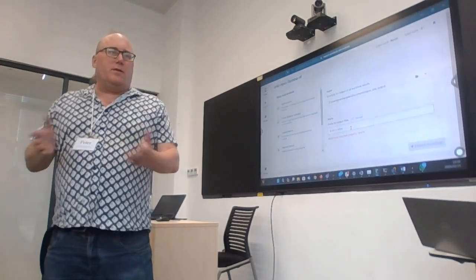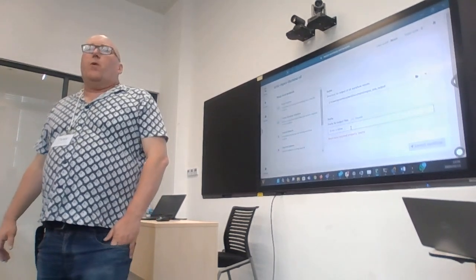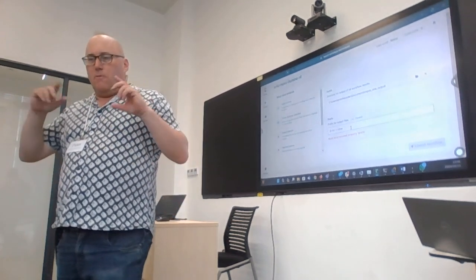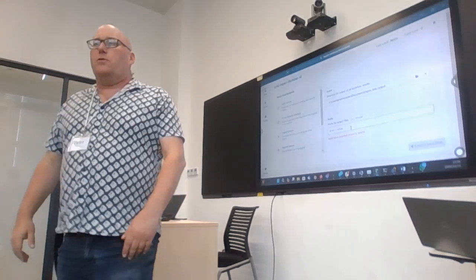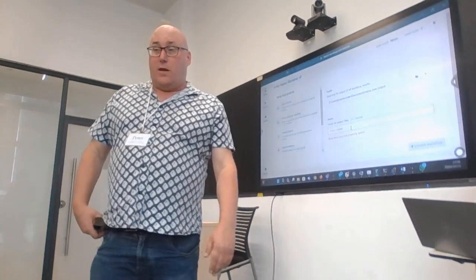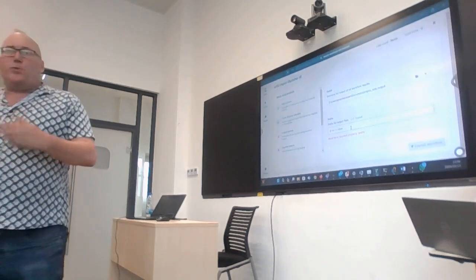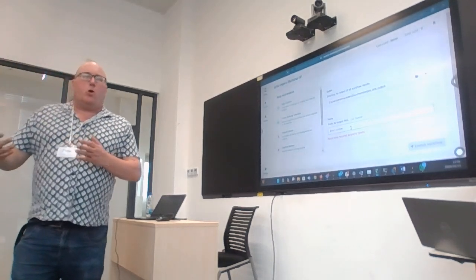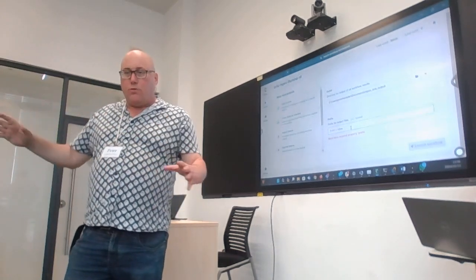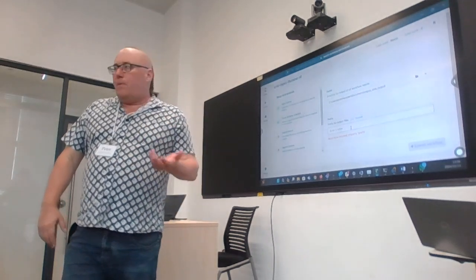It's just that the data input is different. In bioinformatics, so much is actually general. If you are assembling one plant to another plant, it's still the same plant assembly process. When you look at metagenomic ones that are not Amplicon based, you can use the same workflow for just about anything. I hope that it gets even more so over time, because I would like to be able to teach people 1, 2, 3, 4, 5 techniques, and then have them have a very broad base of techniques that they can apply for different things.